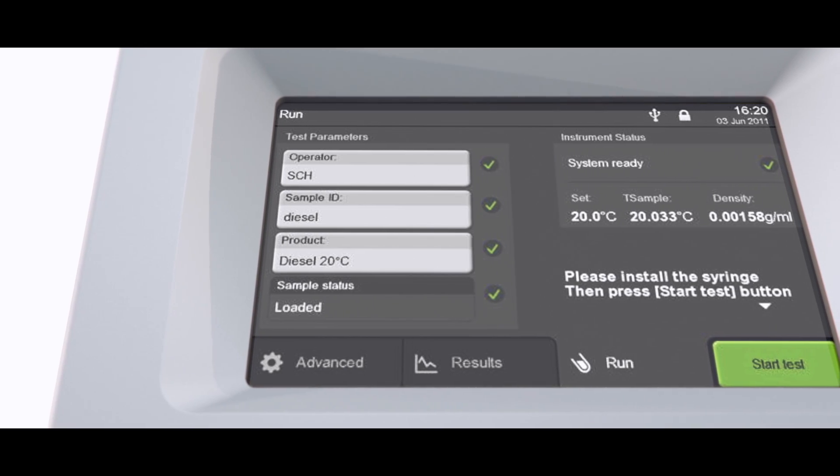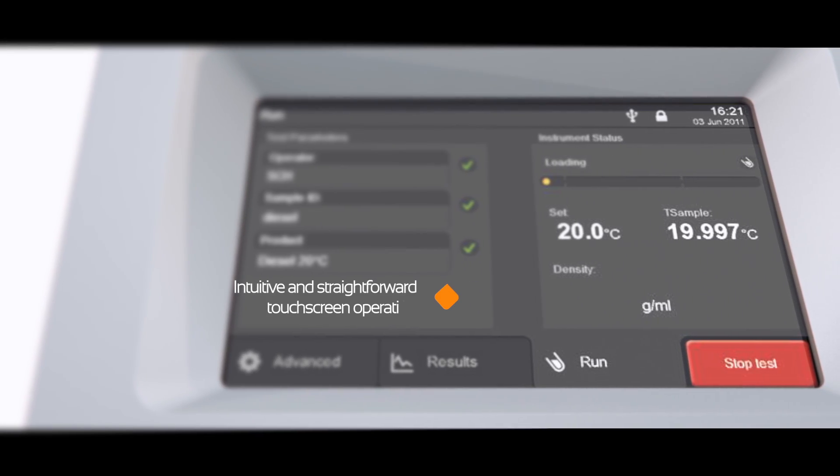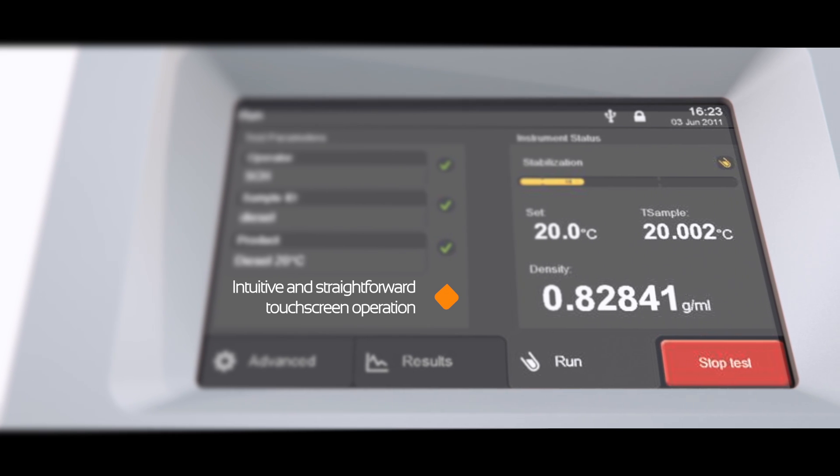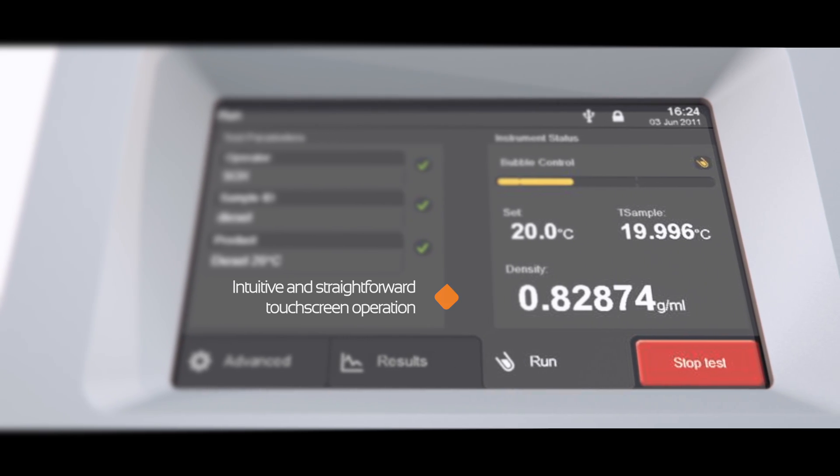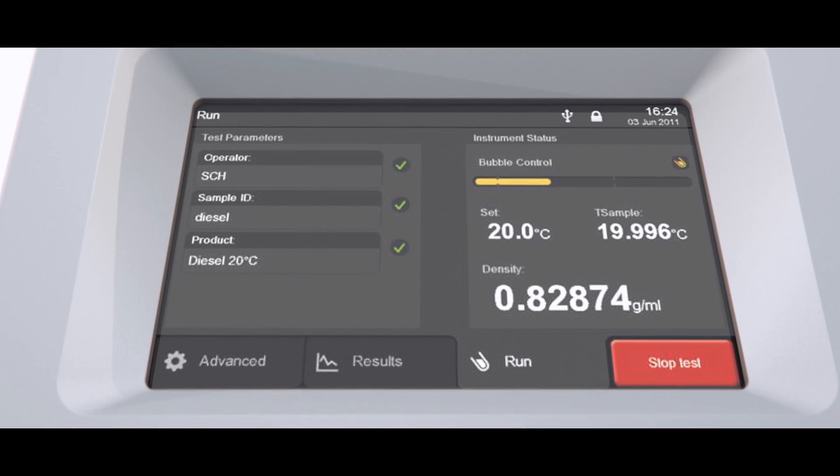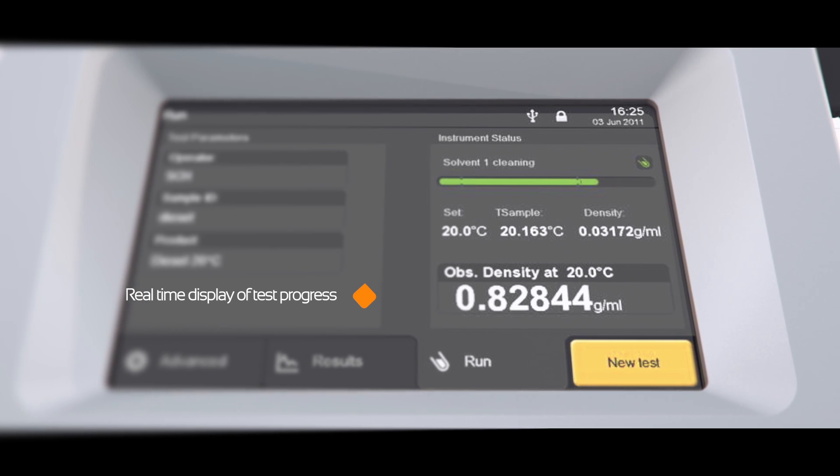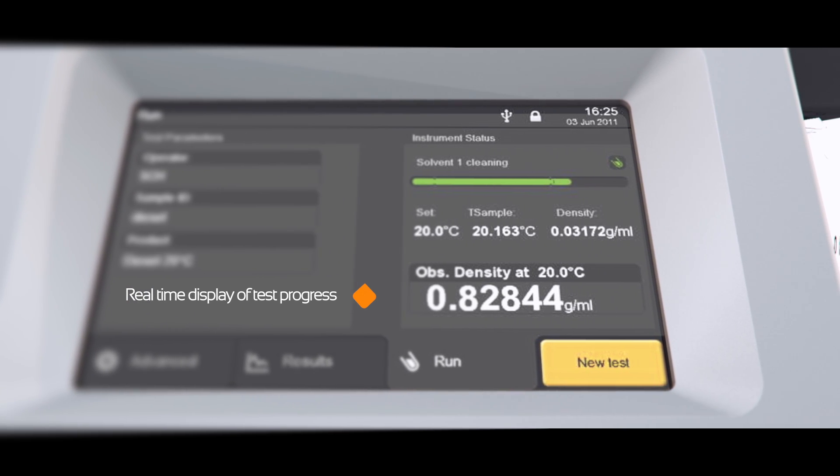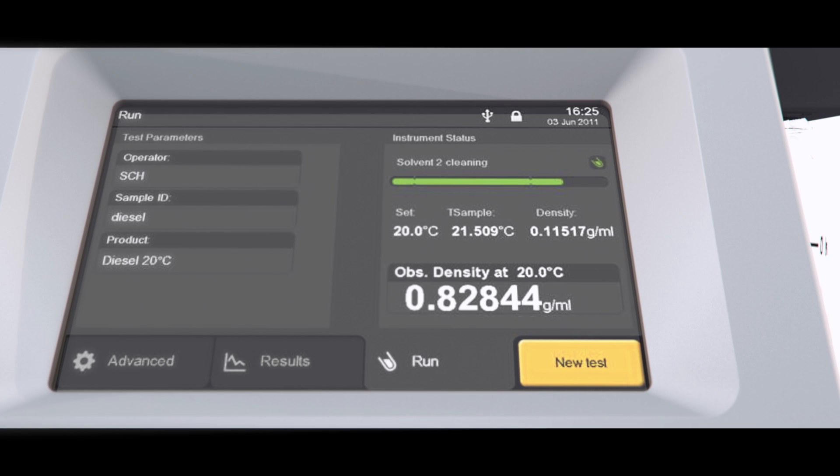They simply prepare the sample to be tested, set up the ID and test conditions, push the start button, then the instrument takes care of the rest. Half of the steps that usually require my team involvement are now handled by the instrument itself.